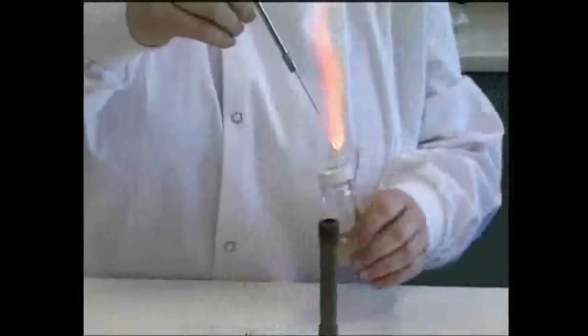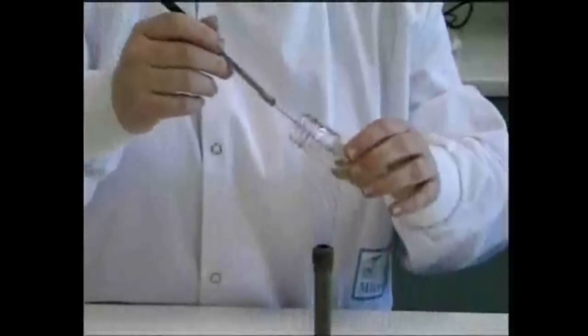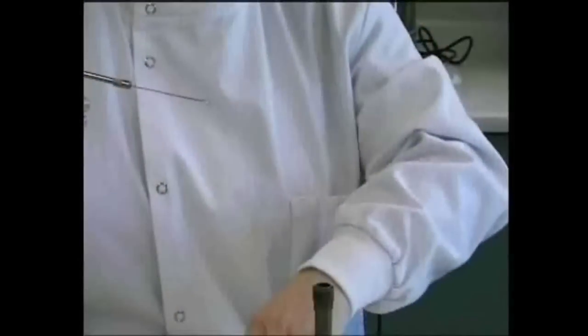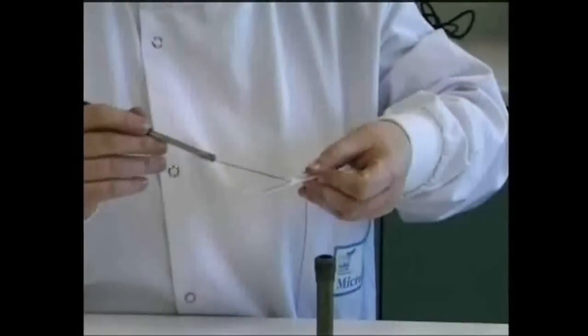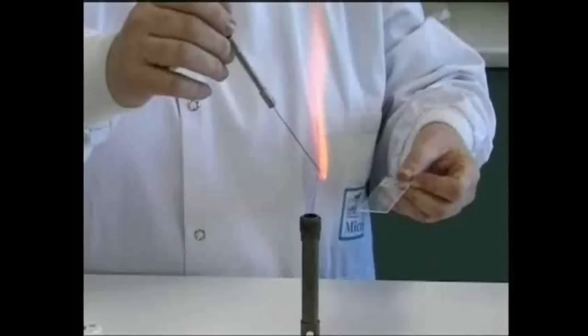If you're using a broth culture for your stain, shake the bottle to suspend the cells, and then place a loopful of broth on the slide, omitting the water. Re-flame the loop when you've finished.